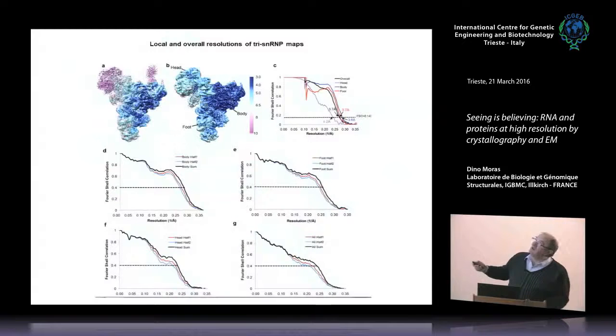Again, now you're becoming familiar with that. The resolution, that's very high, the body, very high resolution. And then the further away you go, you lose resolution. And that fixes the limit. These are conventional factors to fix the limit of resolution that you can claim.